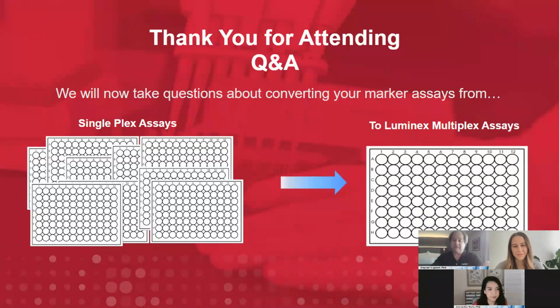So let's say if you have a 100-plex assay, and you need 5 microliters of sample, you're going to need like 500 microliters of sample to get all those data points. But that 5 microliters just by itself with Luminex can give you that same answer in one well of a 96-well plate. So that's one way it'll save you sample.